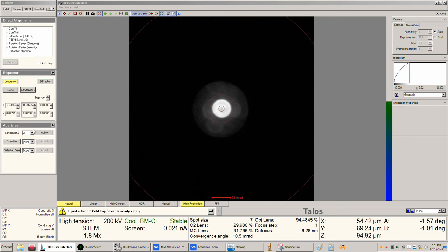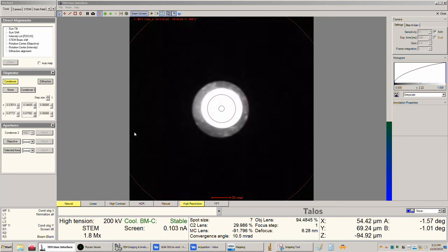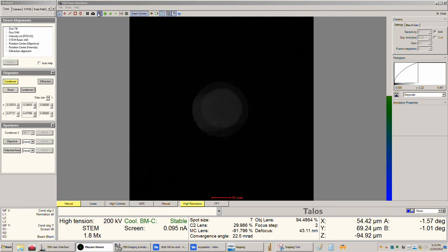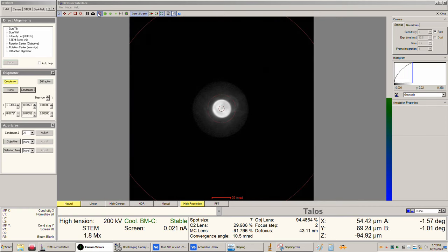Okay, let me really quickly, let's put in the 150. Yeah, I know, I'm running out. Okay, it doesn't really look like it's off. I mean, it looks good. Yeah, so I tweaked it just a smidge there. All right, so let's put this back in. Okay, that looks good.